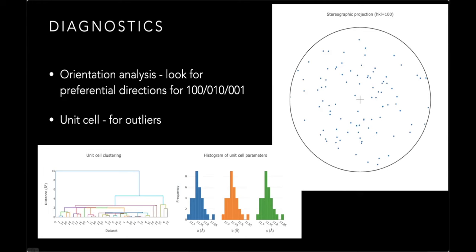So if you're taking data from multiple crystals, the ideal is that your crystals are randomly orientated, so that when you measure data from one crystal and you measure it from the next, that little wedge of data is giving you new information. If you've got crystals that are plate-like, there's quite a possibility that the crystal morphology is following the crystal symmetry, and there is a special direction pointing out of the plate. So if you're doing in-situ data collection and your crystals are plate-like, they are probably going to sit on the bottom of the plate, all in roughly the same orientation.